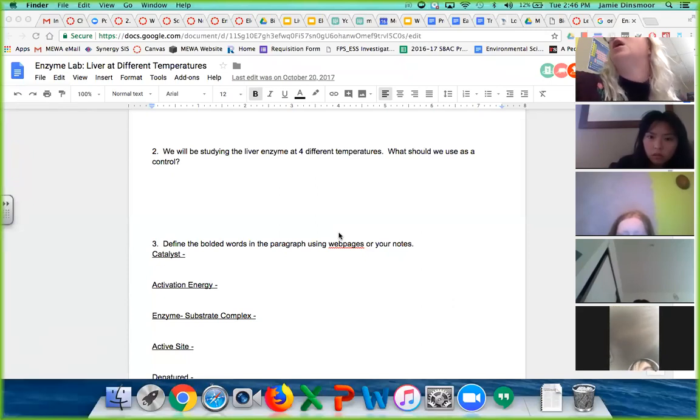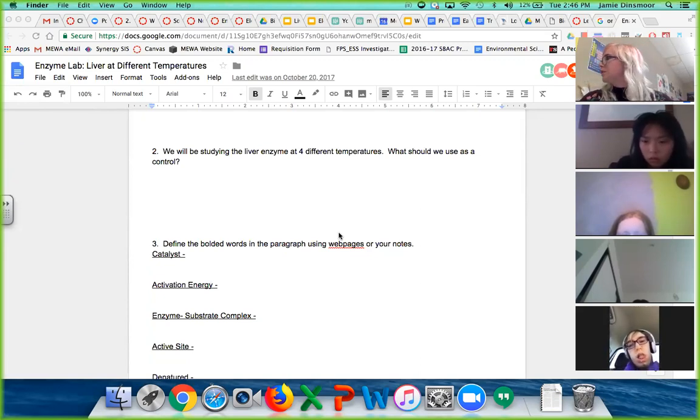Well, thank you, Lane. I'm going to grab a thermometer, and I forgot that I think I did this when it was colder out and I had a jacket so I could touch my hot glassware. So I'm going to use my little scarfy thing. See if I can get this guy out. Might not be the safest concept here. Might not get it out.